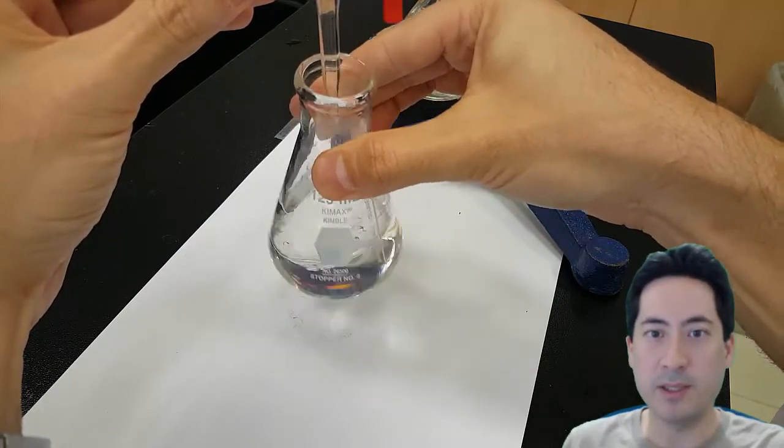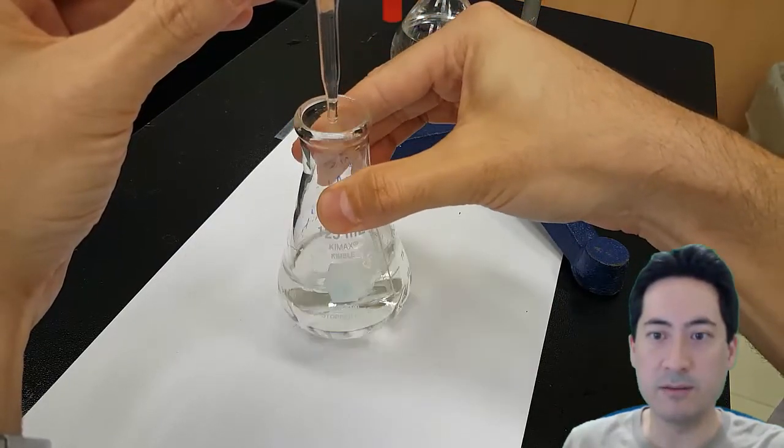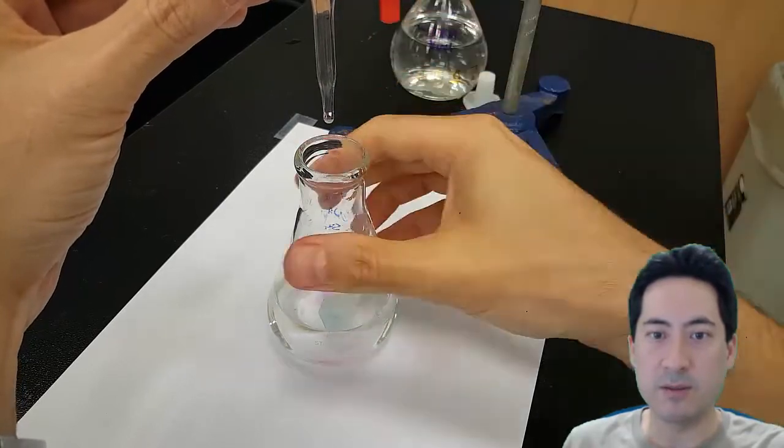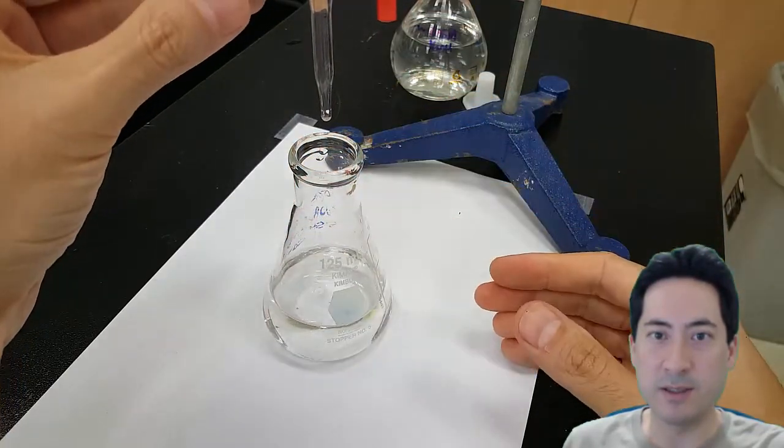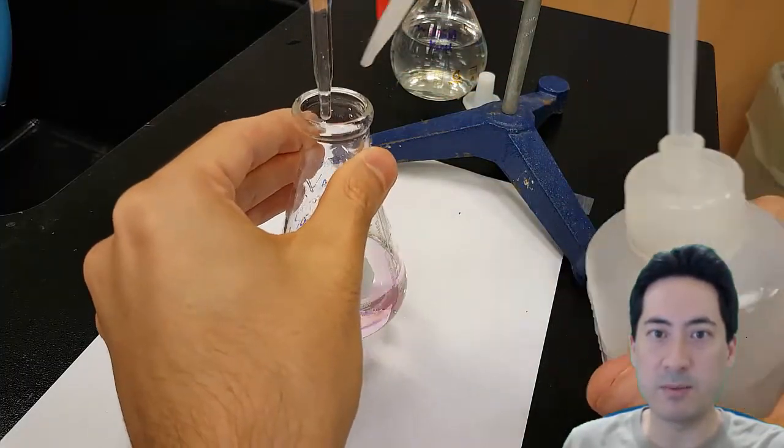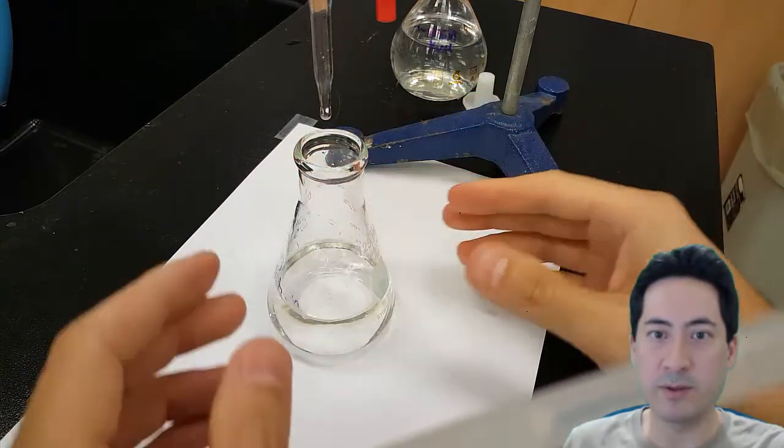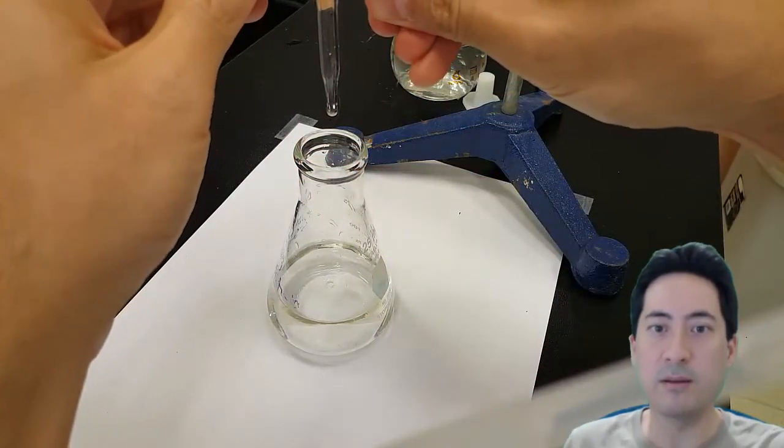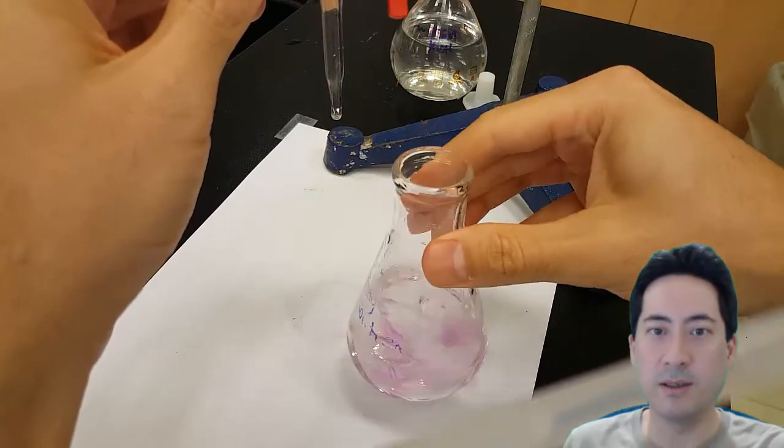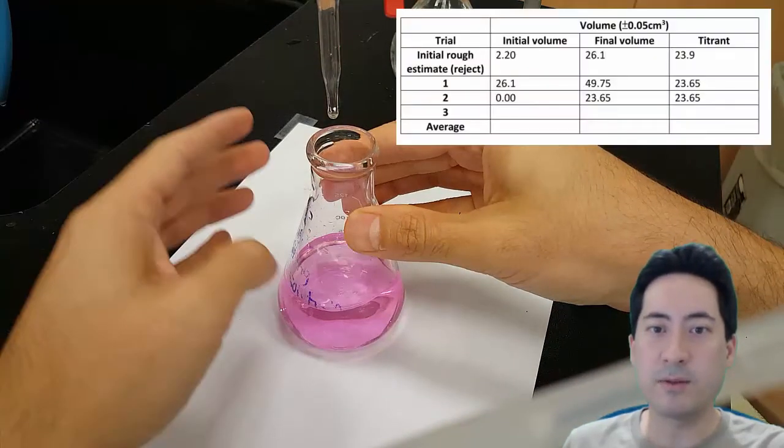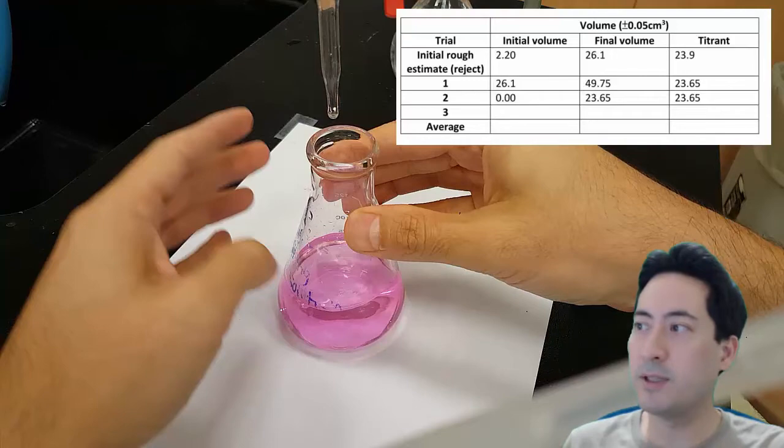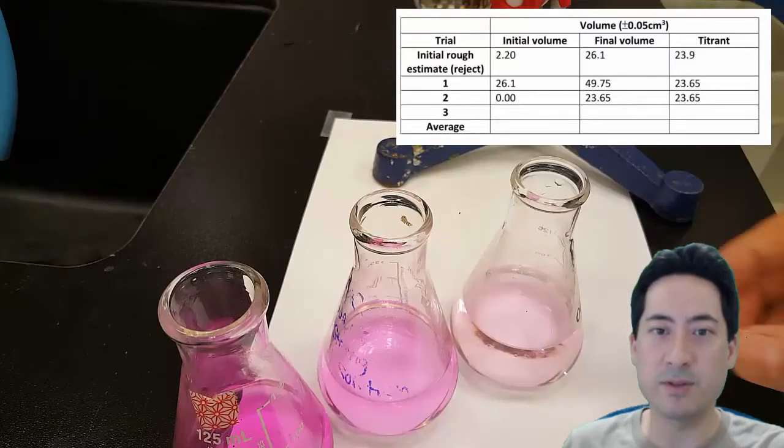Now each time I'm adding a drop, the pink is really staying longer now. And you can see that I'm mixing it quite a lot and the pink just hangs around. So I must do it drop by drop now. Stop at each drop, give it a mix. And there you go. It goes from completely clear to completely pink. So I write that down. That was 49.75 and so the reading is 23.65.